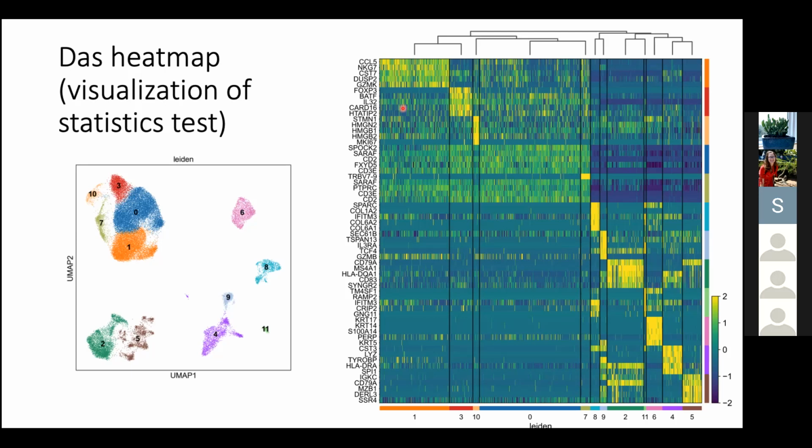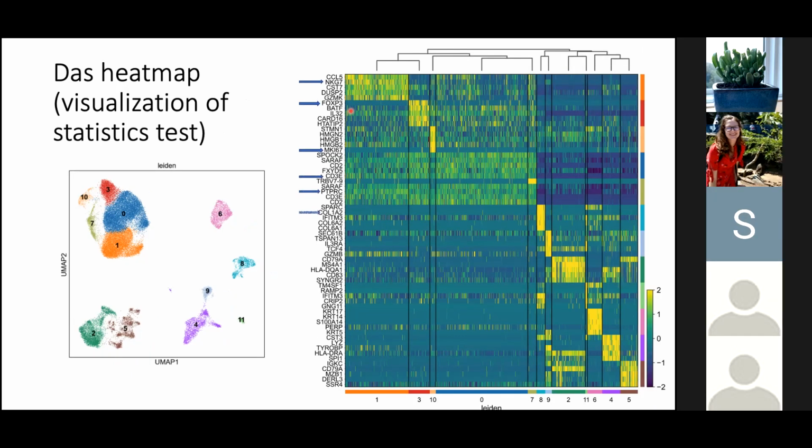If you're a biologist or if you're used to looking at these data, you stare at them, and then you notice that a lot of the data I plotted in the feature plot section are coming up here. You have your CD3E, PTPRC, you have your fibroblast markers. This is for dendritic cells. Blah, blah, blah.